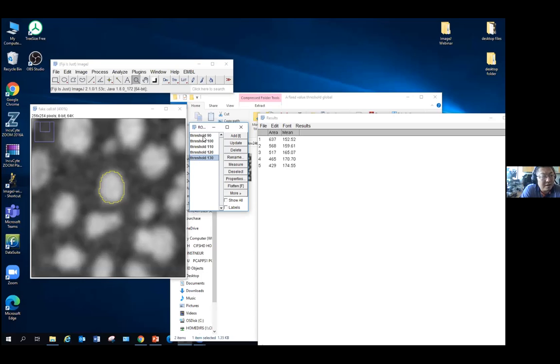You can also use 90, nothing wrong with that. But if you use 90 on one image, you should use the thresholding value 90 on all the images. So that's the important thing: it's always consistent. You can always work on different images. Even on different cells, you may find that different thresholding values represent what you consider the best outline for the cell. But you cannot do that on every single cell, which is what we call cherry picking.